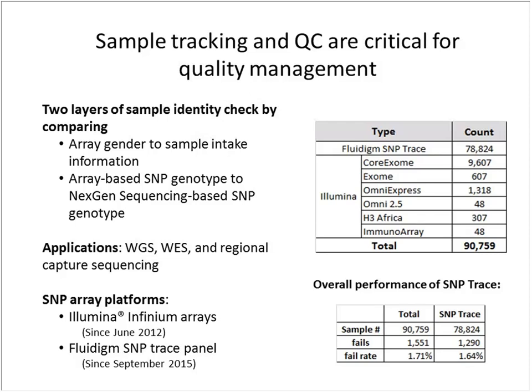So far, all the DNA sequencing applications, including whole genome sequencing, exome sequencing, and the regional sequencing, we have implemented this QC step.